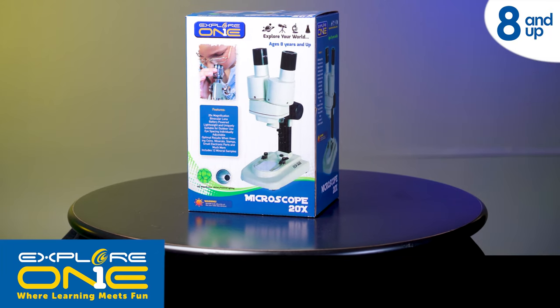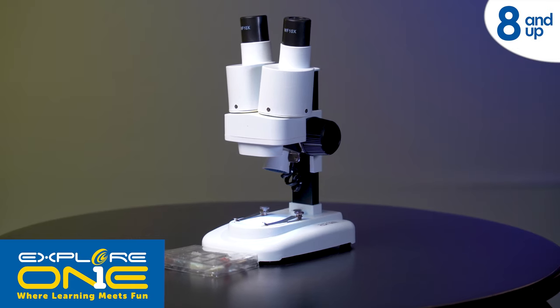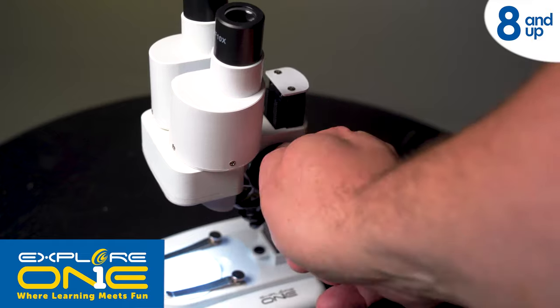The Xplore One 20x Stereo Microscope brings the microscopic world into focus easily with this dual eyepiece design. Lightweight and portable, this powerful scientific tool lets you explore anywhere, even outdoors.